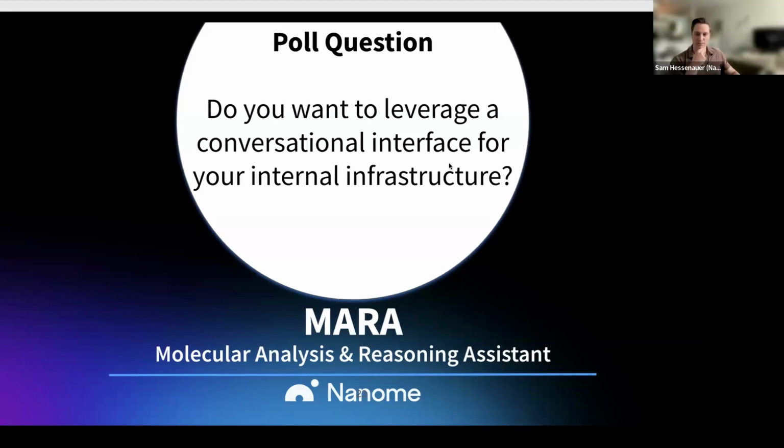Yeah, and jumping off that, there's a lot of times now where I'll go on Mara to prepare a workspace and get everything ready, and then I'll just quick drop it through a tool into the headset, and we're able to jump into it. So it already works well as a complement to Nanome 1.x. But in the future, we'll have Mara's own trigger points, whether by touch, voice, or gaze.